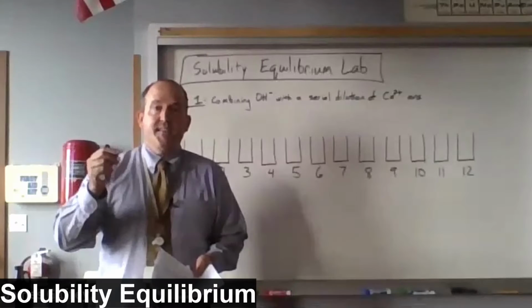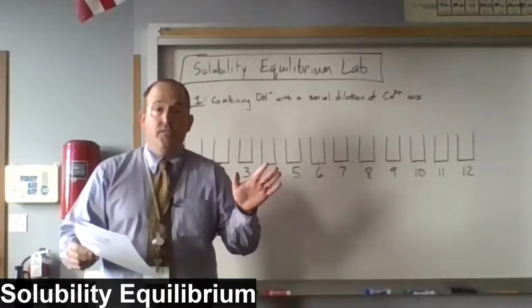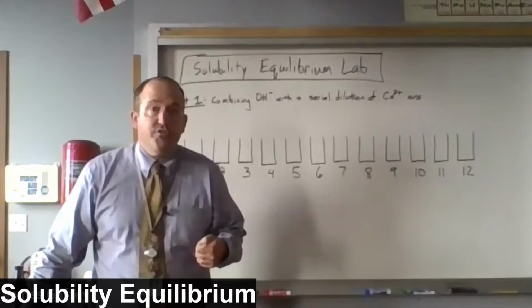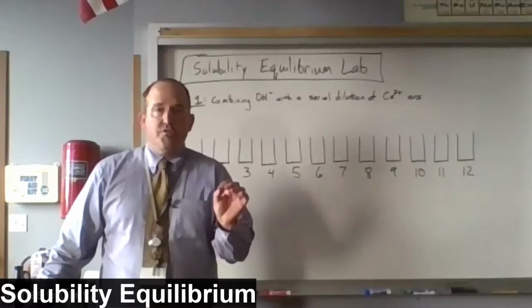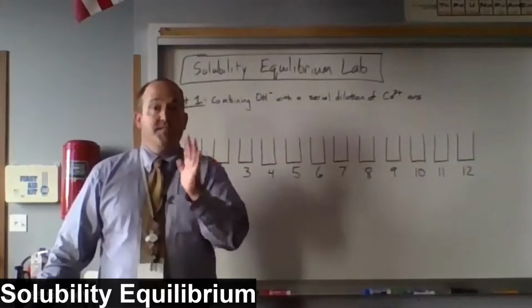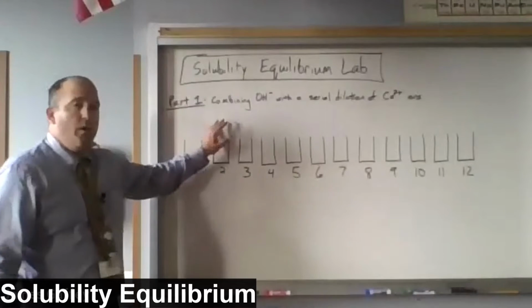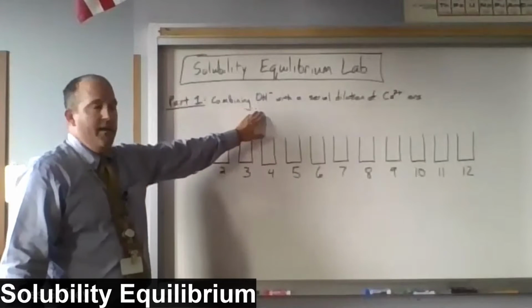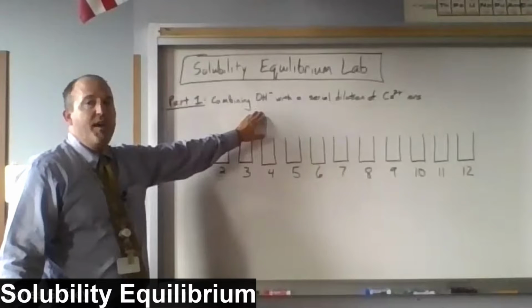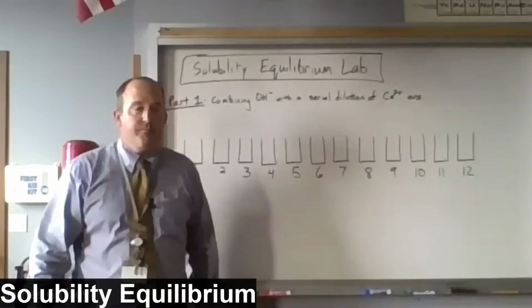Serial as in S-E-R-I-A-L, like a series of things, not cereal like your breakfast food. Okay, and dilution, meaning we're going to dilute ions as we go on in series, one after another. In part one, we're going to combine hydroxide ion with a serial dilution of calcium ions.